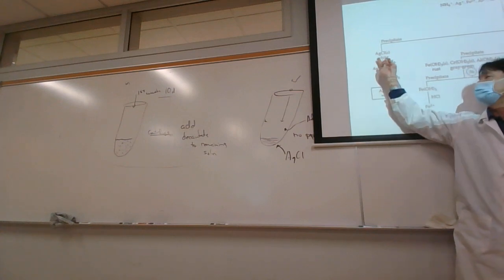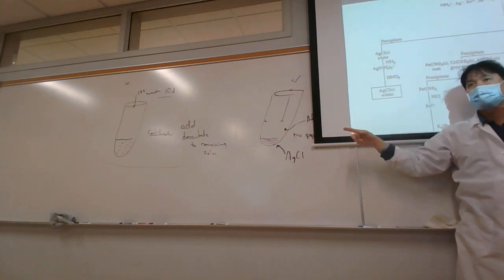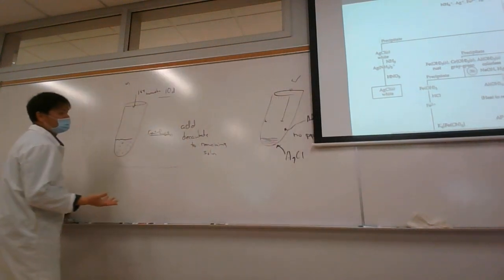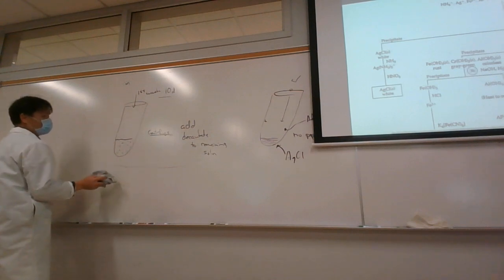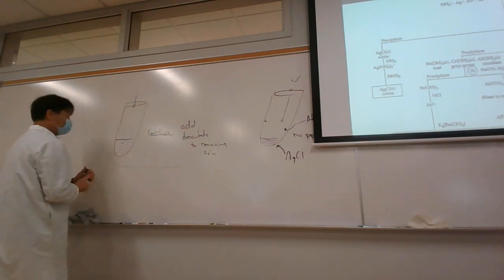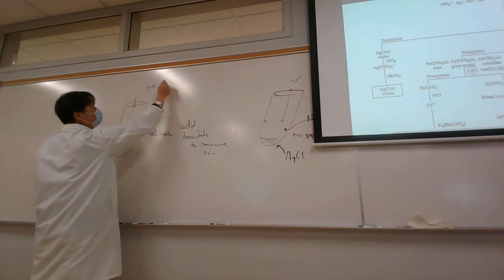We don't want any interfering species in these remaining tests. So I don't stop at one wash here. I do, because the washes don't take very much time. And so the first wash is this. And then what I'll do is I'll do a second wash, and maybe a third wash.